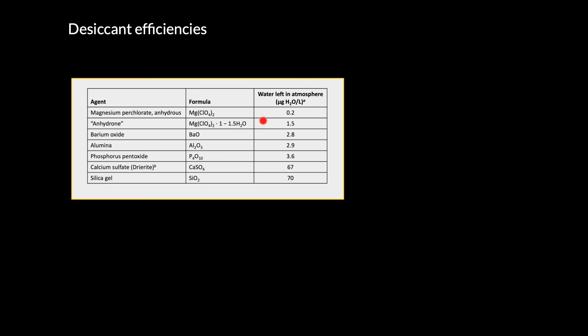These compounds are typically more difficult to work with, although if you need your sample dry, of course you have to use them.